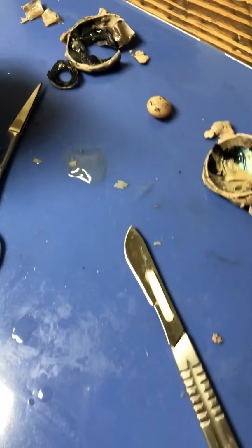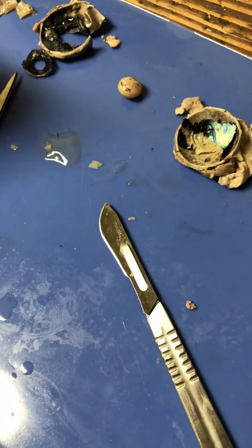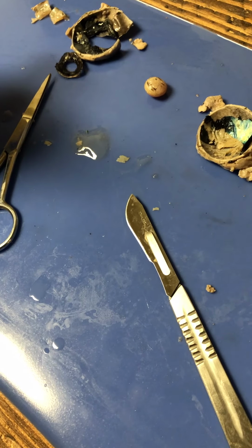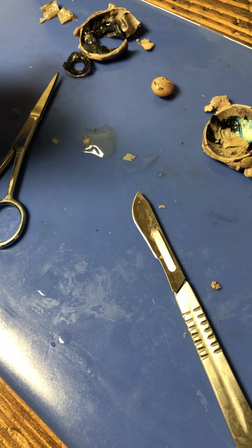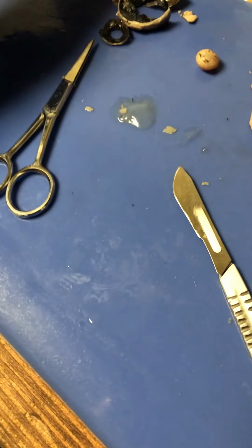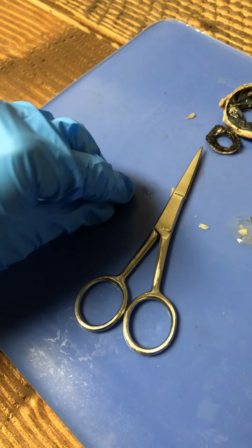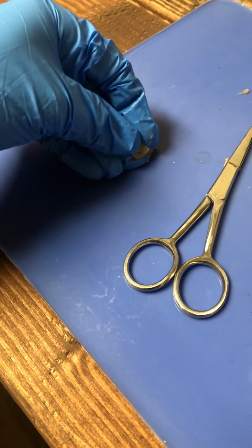Okay, so we're just gonna start with the eyeball. We're gonna start with the front and then just kind of work our way back. So to start out, this is the cornea. I kind of already cut it up like it said in the dissection. It's the covering that allows light to enter the eye.